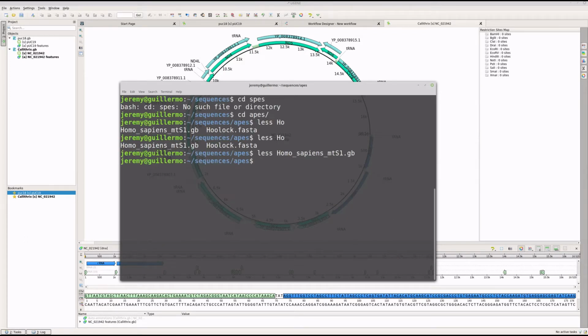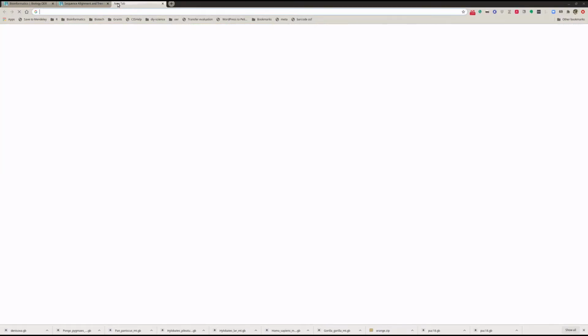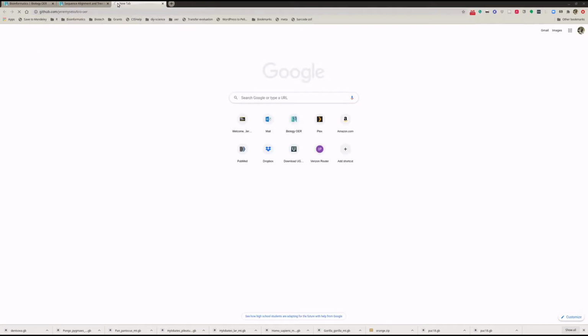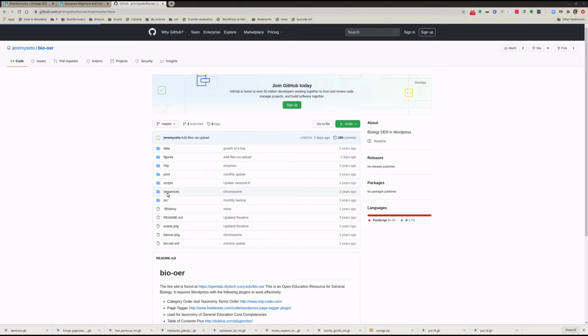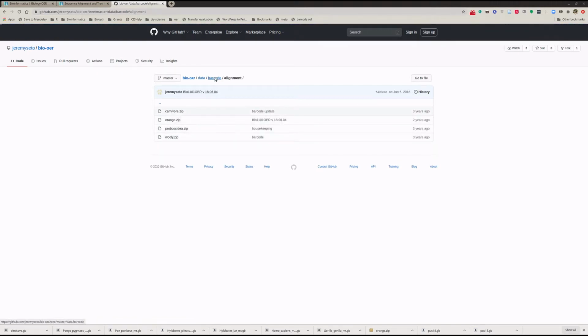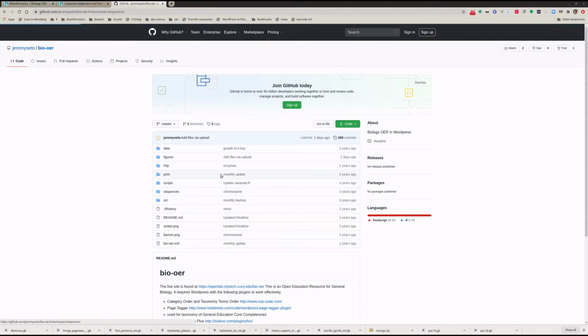So we're going to go and re-download these sequences appropriately. These came from, had these in GitHub, so we'll go there. And I thought I had done it appropriately, but I had not. And that's exactly why it did not open properly. So they're probably under data. You would think they're under sequences, but they're not. Under barcode and under alignment. And so, nope. These are actually the homework ones. So let's see. Data. Maybe they are under sequences then. Sequences. Barcoding. There we go.